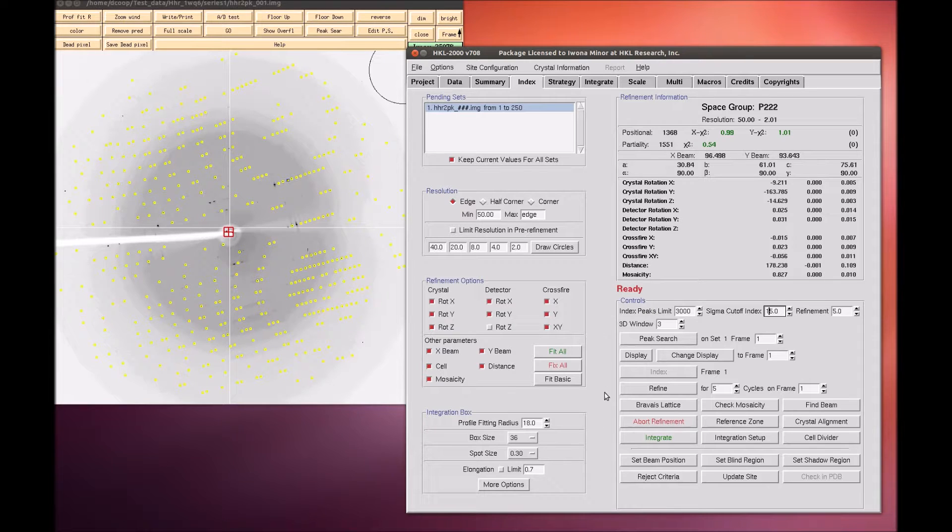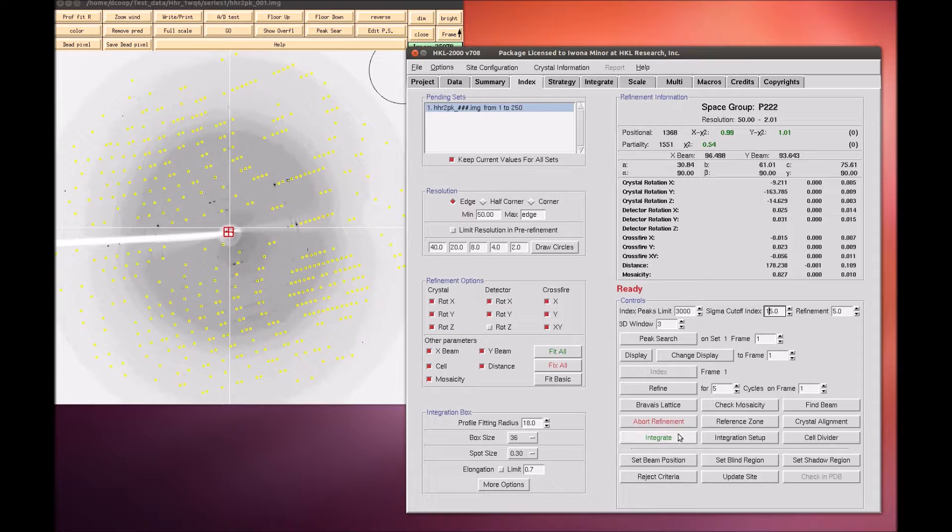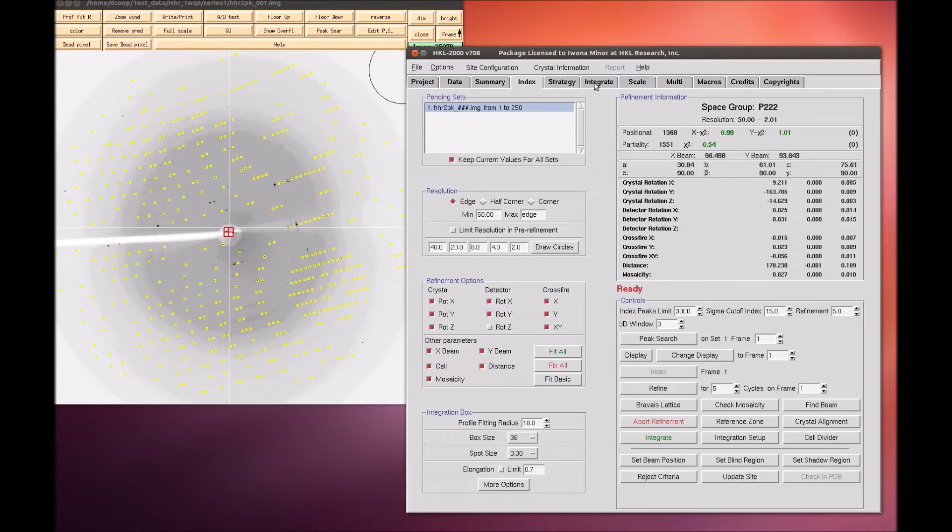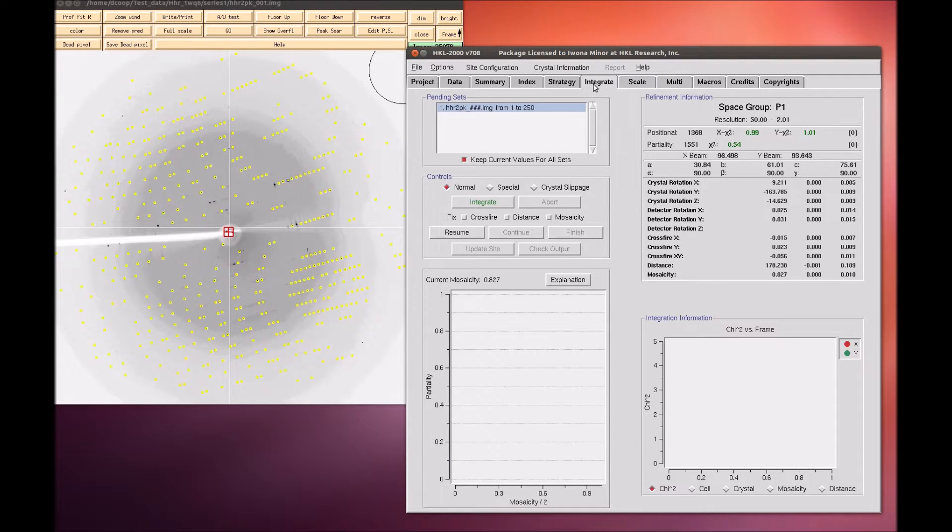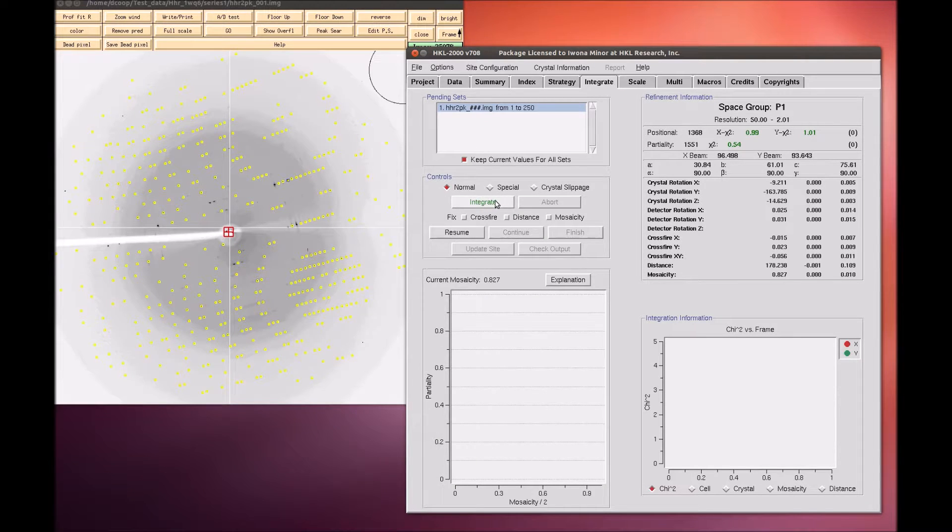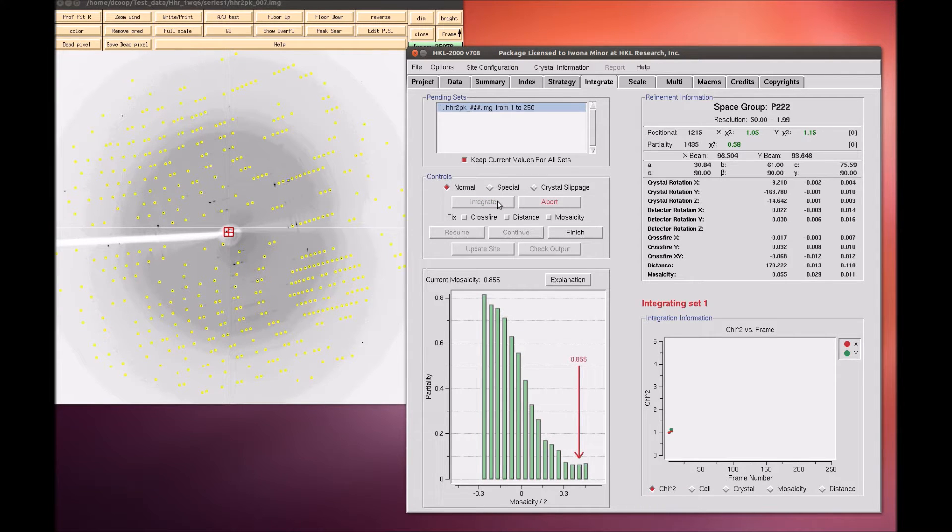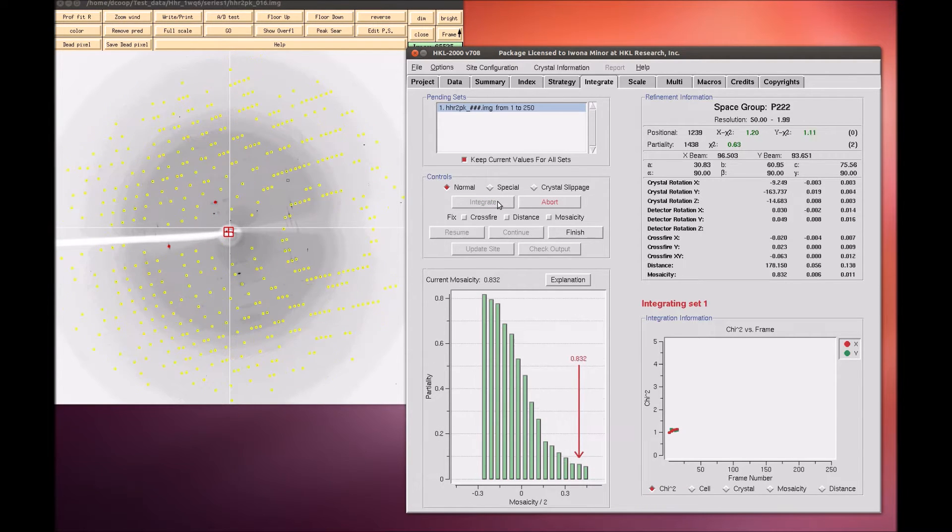Once you are satisfied with the unit cell, use these parameters to integrate the whole dataset, which will index each individual frame and record the intensity and error associated with each peak. The process can be started with the integrate button on the index tab, which will automatically switch the display to the integrate tab. Alternatively, use the integrate button on the integrate tab to start the process.